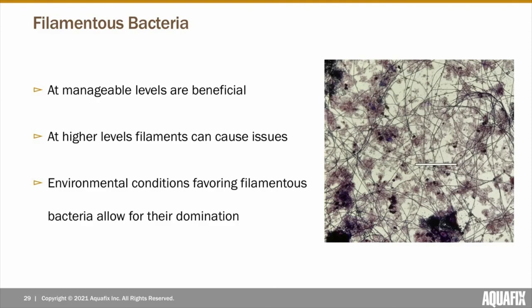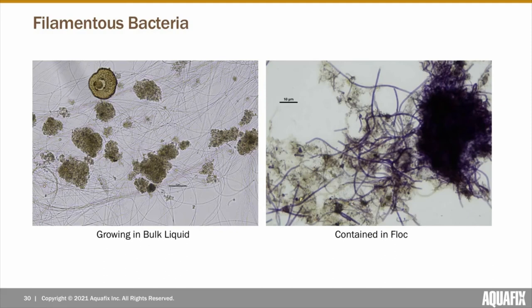Another aspect we look at is the type and abundance of filamentous bacteria present. Filamentous bacteria can be present in every wastewater plant at various levels. At manageable levels, filaments can provide structure and support for flock, so some levels are necessary and beneficial. However, when environments favor filaments, they are allowed to dominate the system and out-compete flocculated bacteria, leading to issues such as bulking and foaming. Filaments tend to have distinct characteristics, so identification is done largely through appearance — we notate whether filaments are growing in the bulk liquid or within the flock, their abundance, cell shape and size, and whether the filament is motile or not.